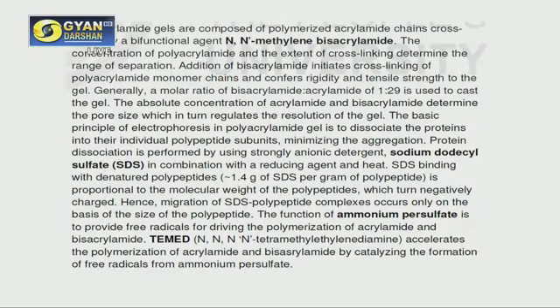This is actually the recommended concentration, that is bisacrylamide to acrylamide. The molar ratio should be 1:29. That is normally used to cast the gel. What is the function of bisacrylamide? It strengthens the cross-linking of the polyacrylamide monomer chains.